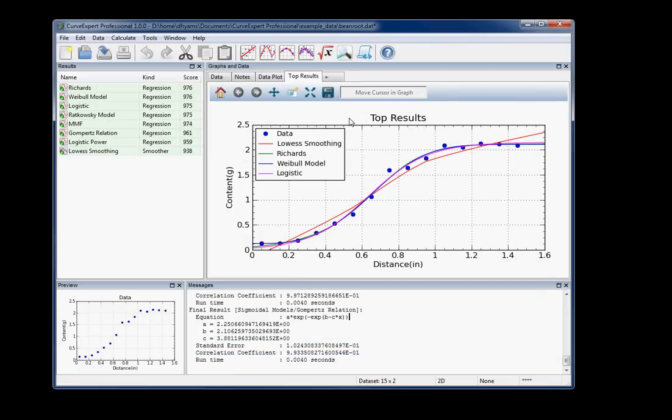Now you can also get to that result window in various ways. I showed you how to get to it straight from the plot. You can also double-click here on any result that's in the results list to get the same thing, or you can right-click on any of those results and select Details.